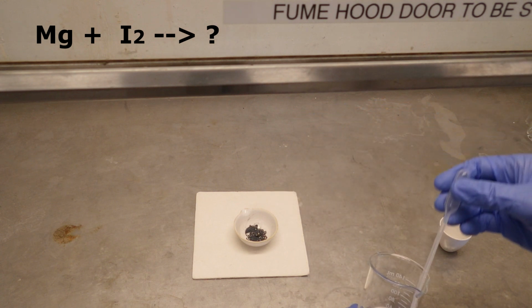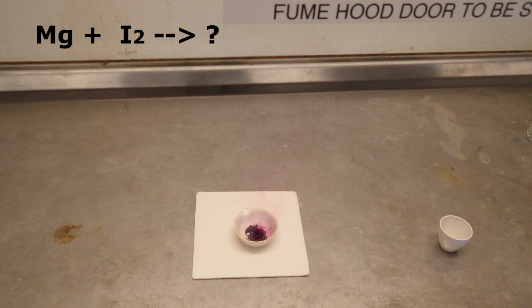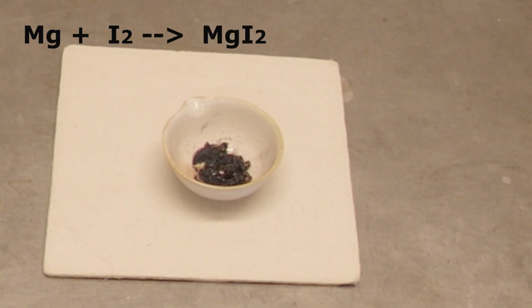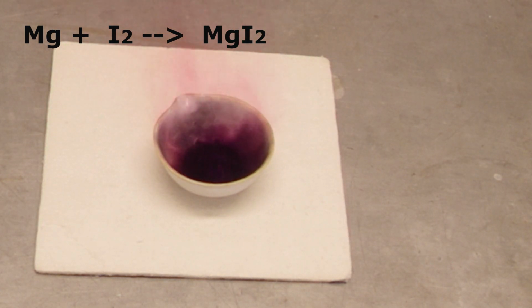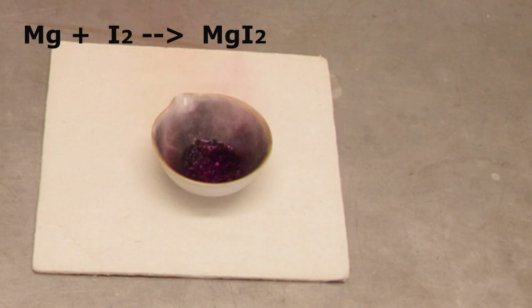Now I can see a little bit of bubbling. Okay, it started, but it seems to have subsided. Let's try more water. That's looking better. So the purple vapors, that's not magnesium iodide, that's iodine. Iodine sublimes from solid to gas. It's a purple vapor.